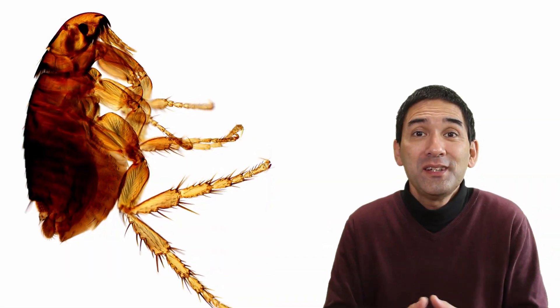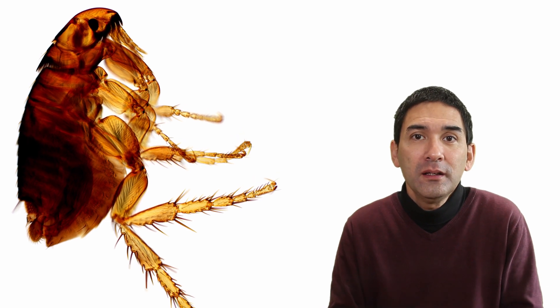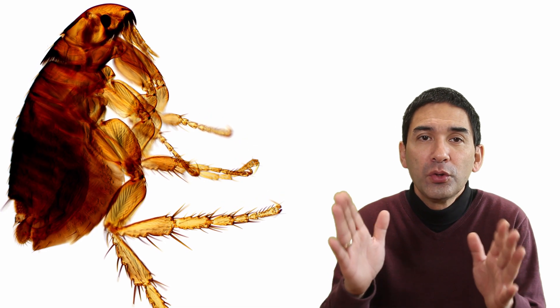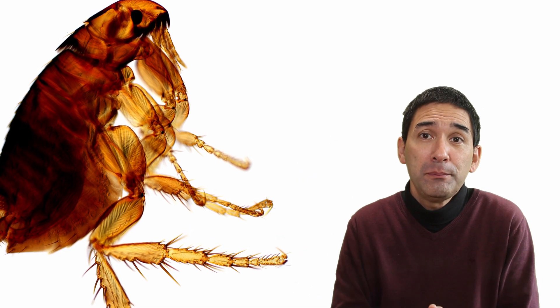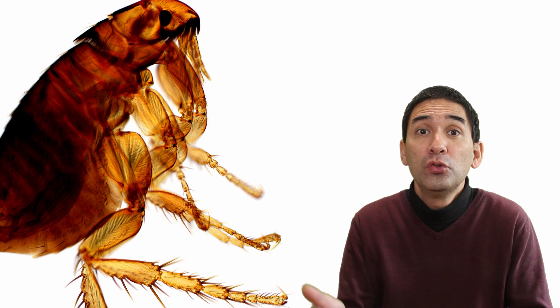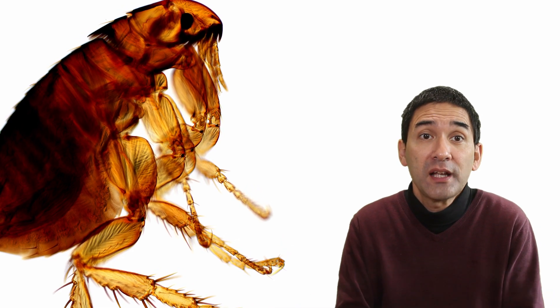The flea that you can see here is a so-called dog flea and it's able to jump about 20 to 30 centimeters, which is about a foot. This might not appear to be very much, but it is about 100 to 200 times its own body size.